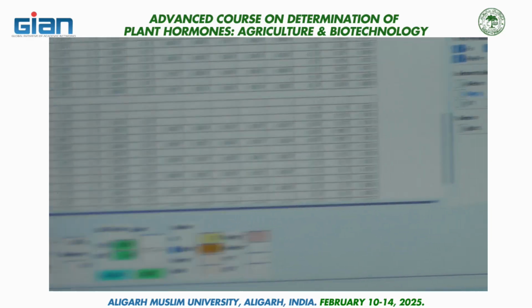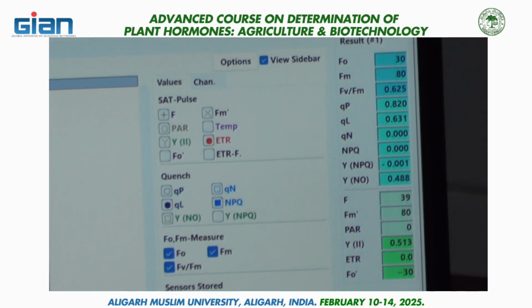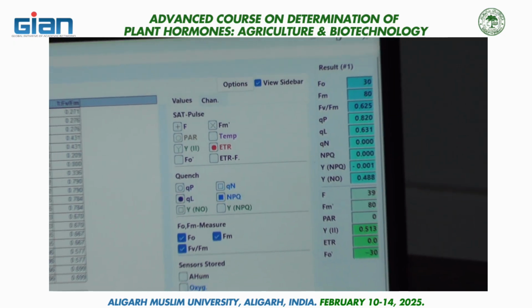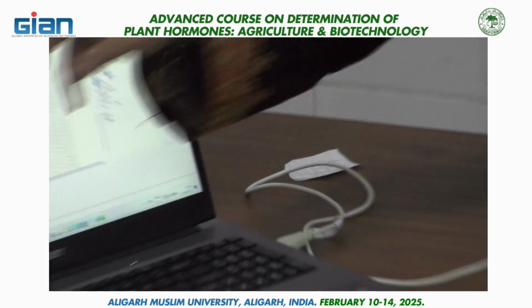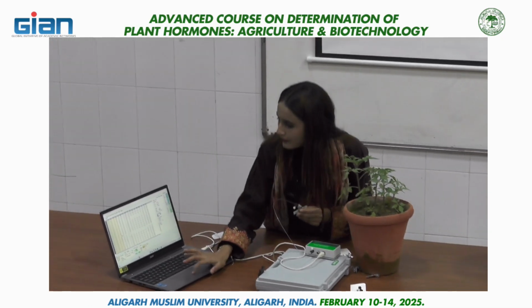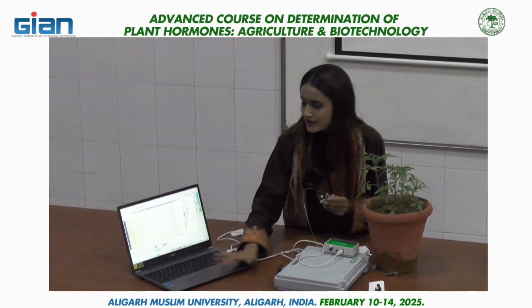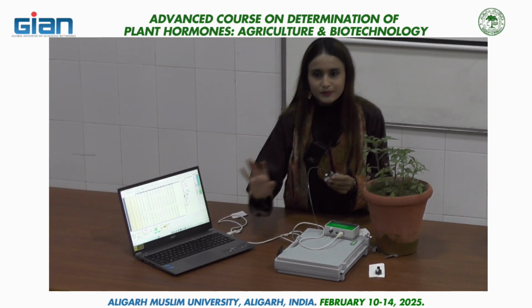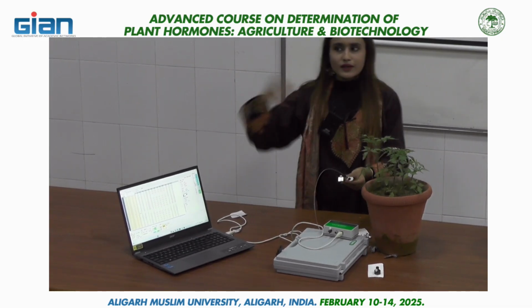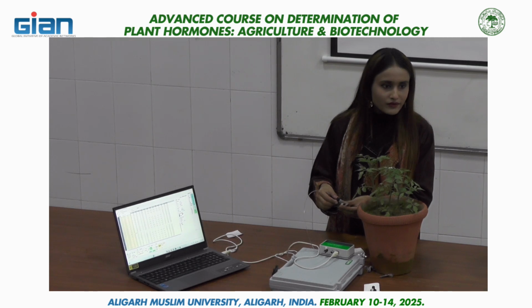Is it clear? I think it's very simple. Apart from that, you can save your data as simply as you save data in MS Word. Just click on file and then save this data on the desktop. It's quite easy. Now you all can come in groups of 10.